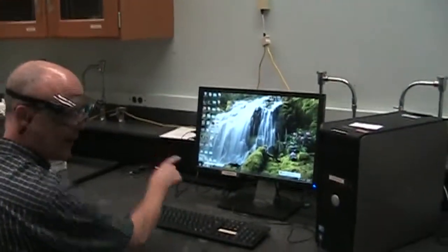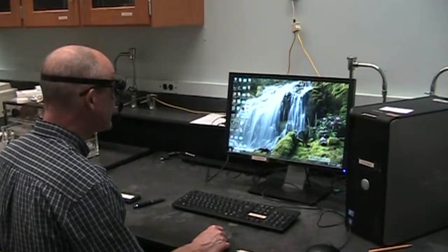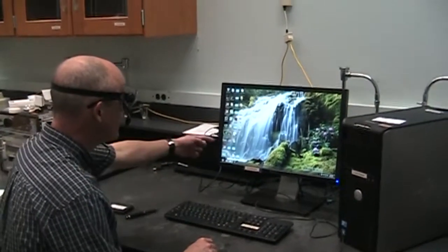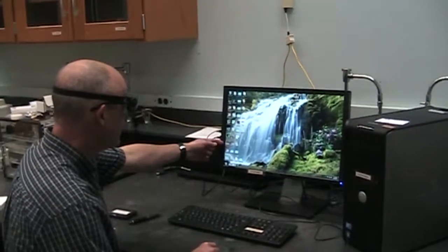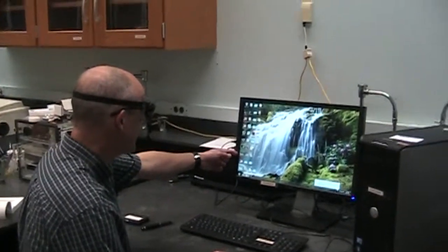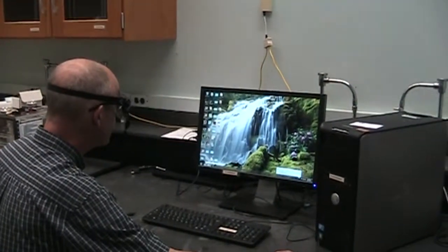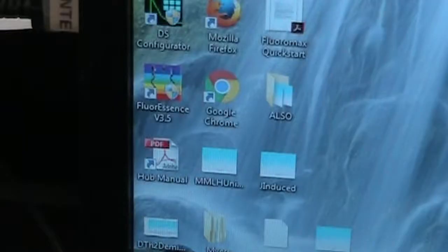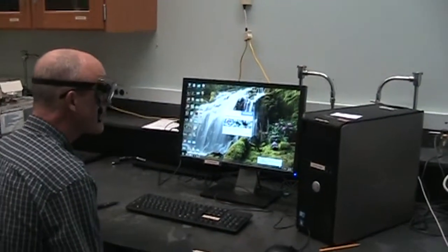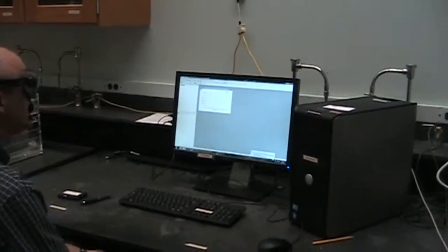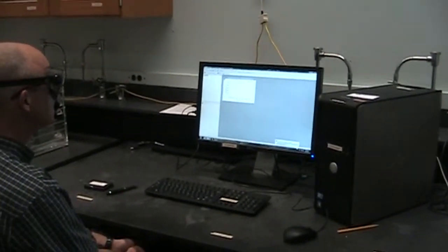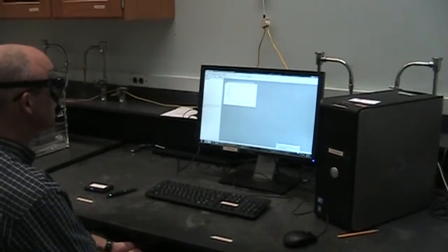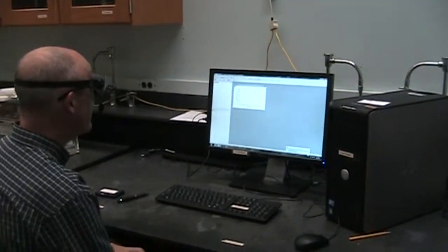The software that you're going to use to collect data on the instrument is called Fluorescence. Currently we're using version 3.5, so I'm going to double click on this icon to start the software. And the main page opens up.